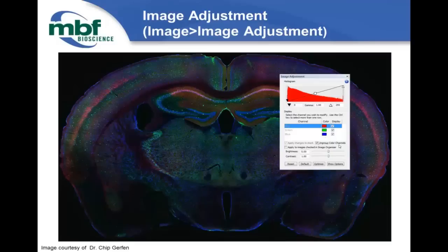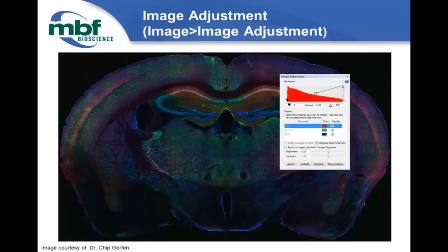You can choose to ungroup the color channels so you can view each channel separately. If unchecked, you can only adjust brightness and contrast for all three channels together. When you ungroup, you're able to adjust the brightness, contrast, dark point, white point, and gamma for each channel separately, giving you more control. If you've loaded multiple images that you need to modify, you can check the option to apply changes to images checked in the organizer, so changes are applied across the board — helpful for staying consistent across different groups or animals.